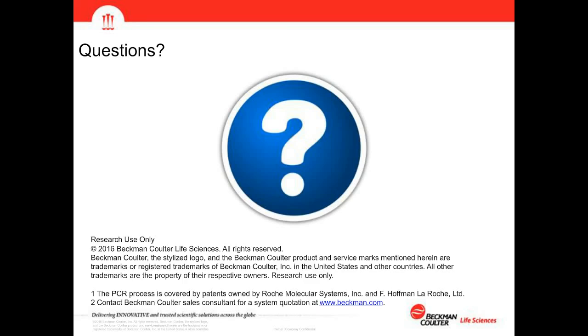Can you link the sample tracking to LabGuru? That's a good question. I'm looking at LabGuru now. I don't see why not. As long as LabGuru is able to handle CSV formatted files that the sample tracking could generate, I would need to know more specifically about that particular application before I could offer you a solid yes or no.